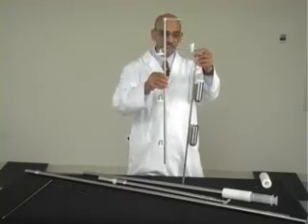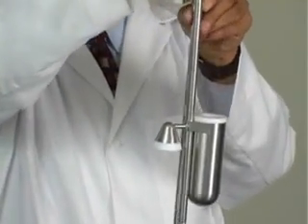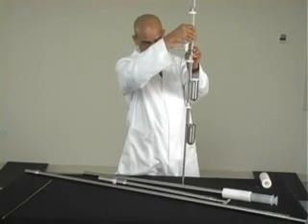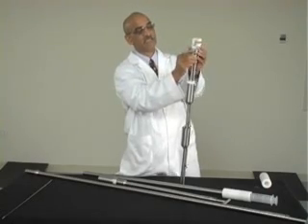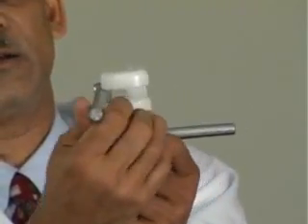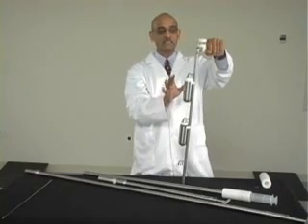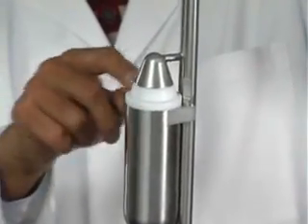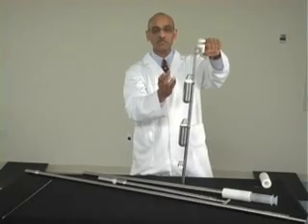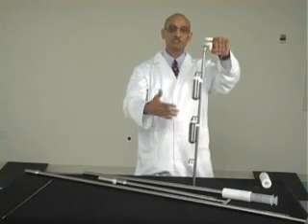Now this shaft goes into these slots on the cup and slides down, as you can see. Once the last one goes through the cup, you bring this plastic piece back and lift this handle and let it go through this slot. Now the sampler is in the closed position. You can see that the cover is sealing the cup, which has the bottle inside. You then insert this into the liquid or semi-solid which you are trying to sample.